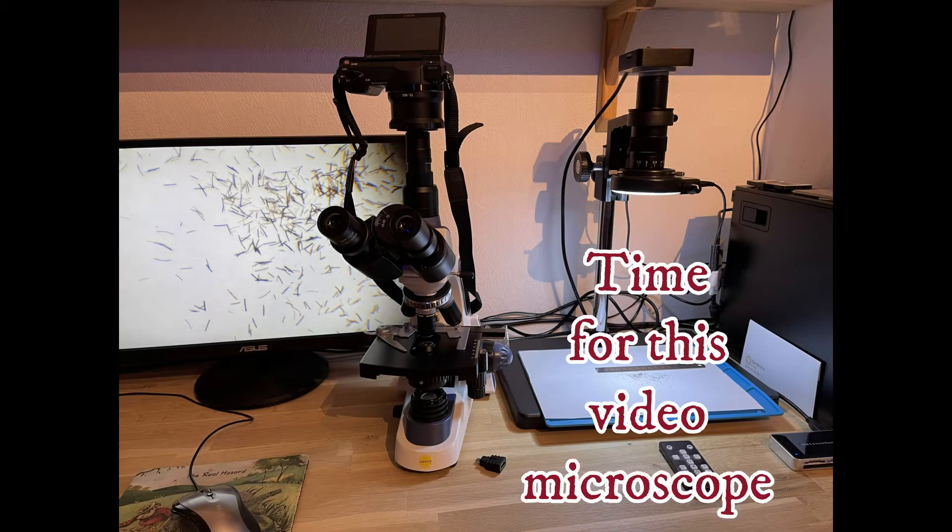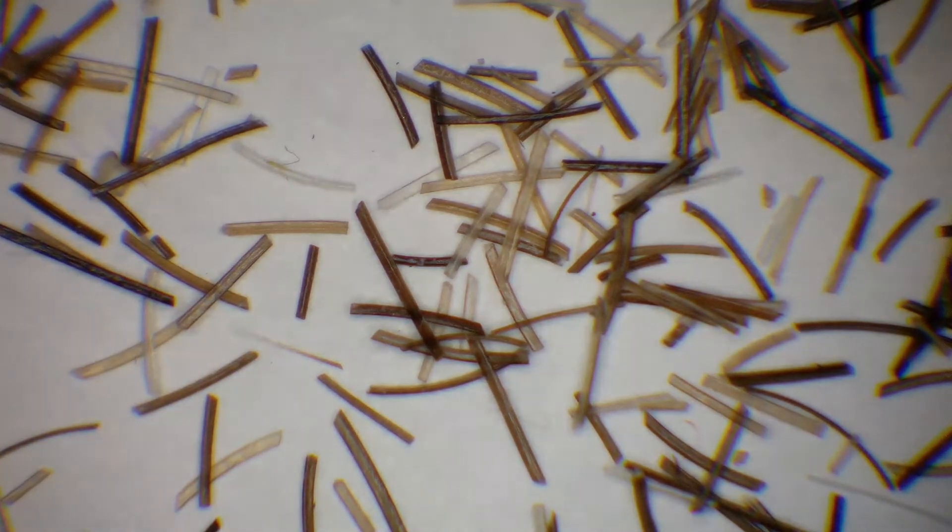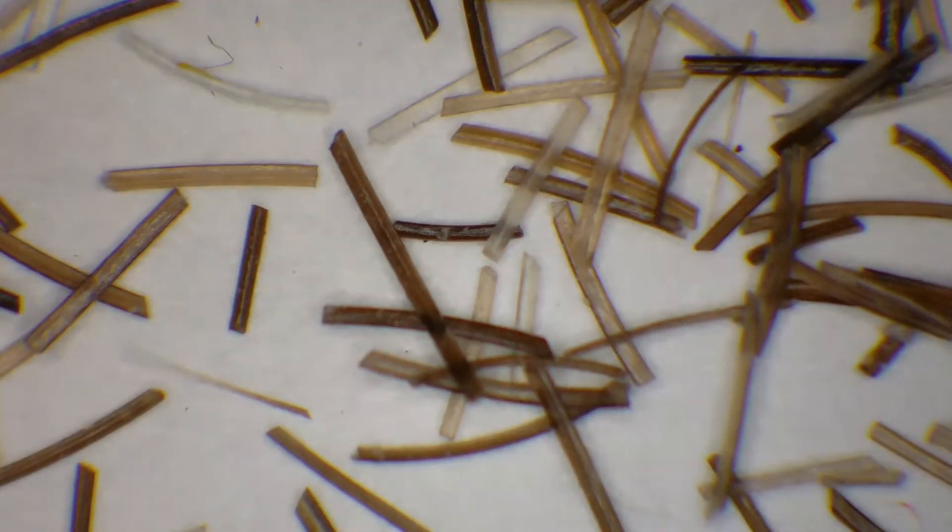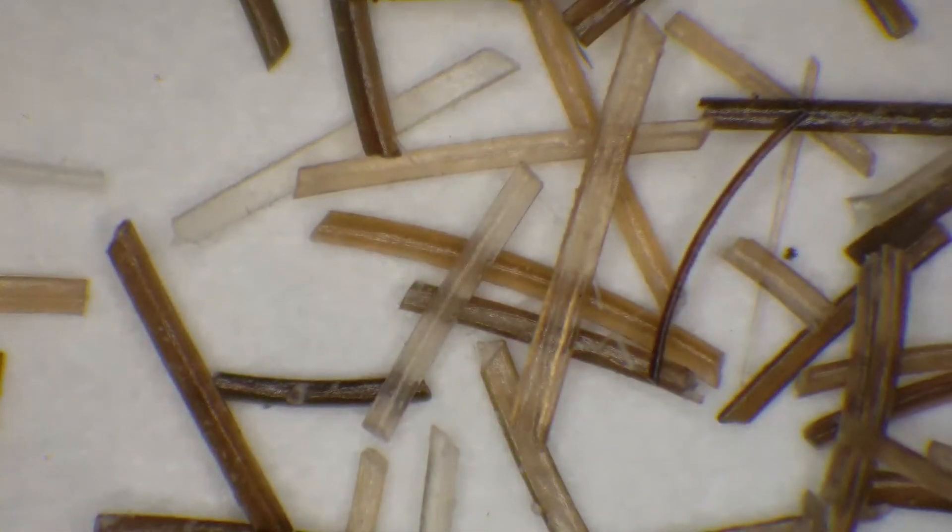So it is time to take a closer look at the shaved beard and we will start with the video microscope to the right. I will start now by zooming in step by step and I will take you through this quite quick. You can see how we are getting closer and closer. Almost at the maximum zoom now.